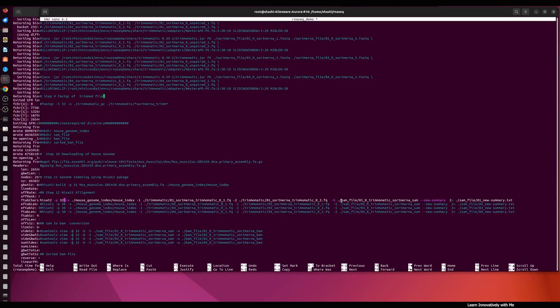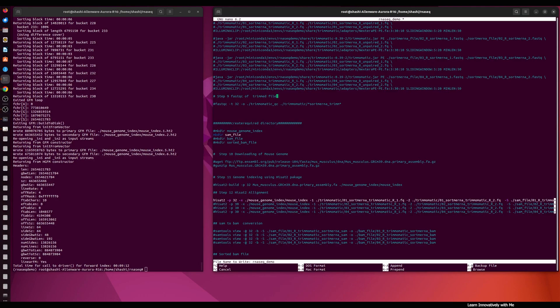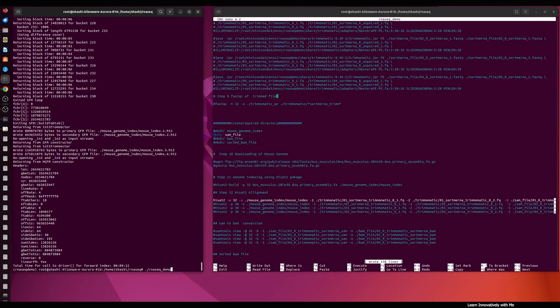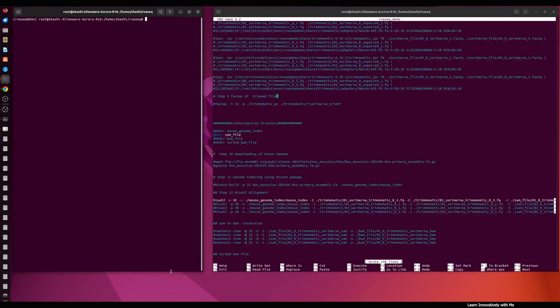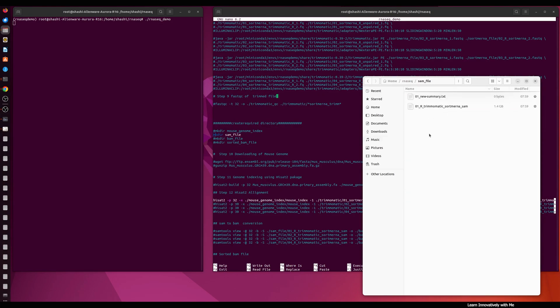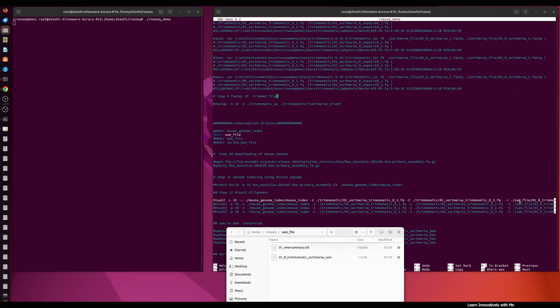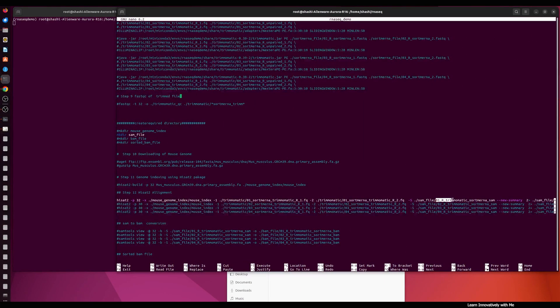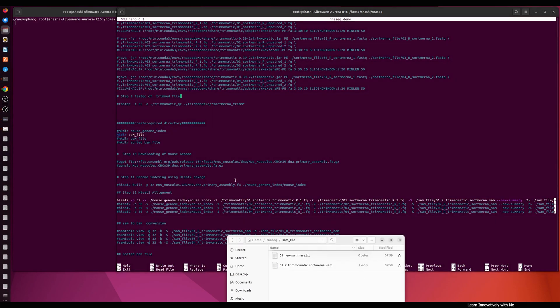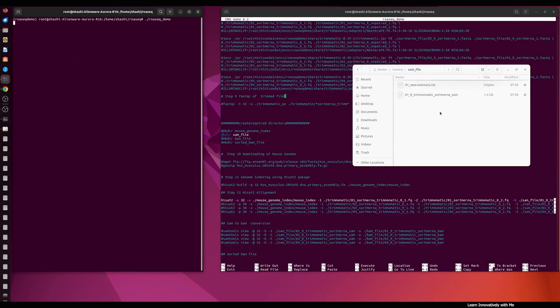Before running the alignment we need to create the SAM file directory to save the output and the summary. I have already written the mkdir command for that. I'm going to activate the SAM file directory command, save with Ctrl+O, and run the script again. First I'll clear the screen with the clear command, then run the script. You can see the SAM file directory is created and the script is running to generate the alignment file named 01_trimmomatic_shortmerna.sam.